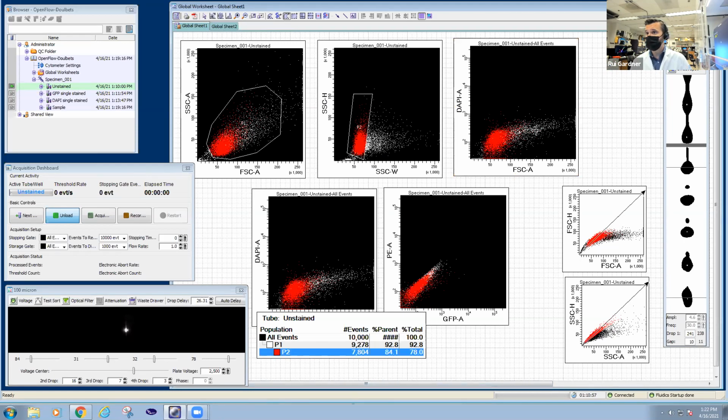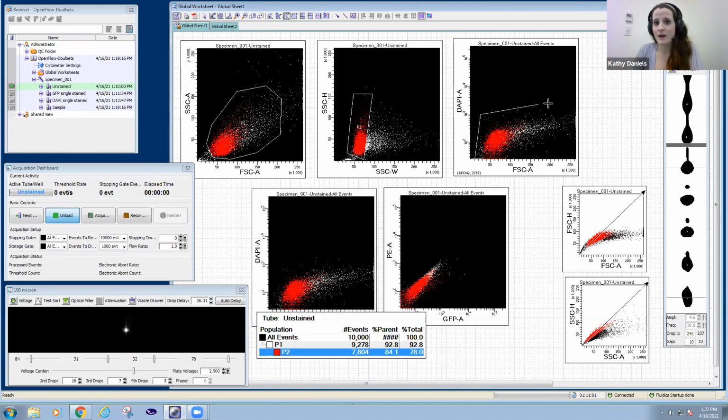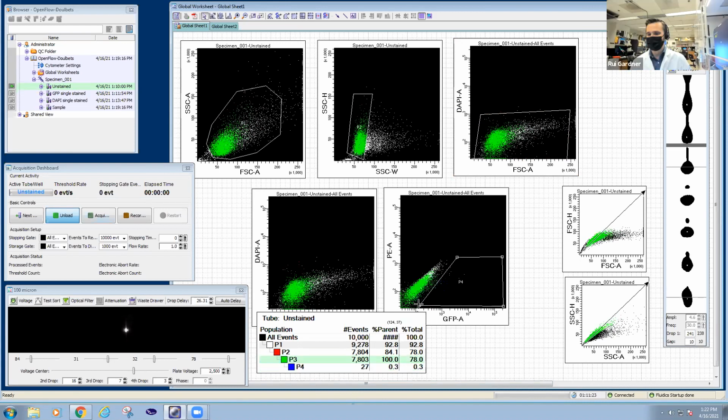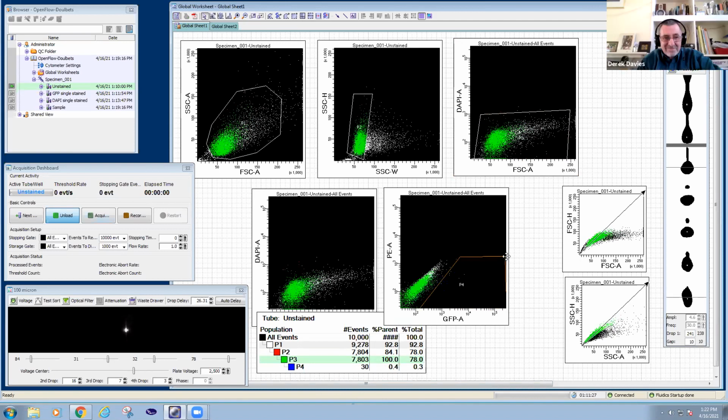Kathy, I don't know if you wanted to say something. Yeah, I just wanted to say I think it's a good thing for everyone to be aware of all the options as well, because it's a really good thing to explore based on your specific cells what has the best resolution. So sometimes you might have one set of cells, and it does not necessarily mean that that gating strategy is going to apply to all. Absolutely, you shouldn't always believe everything we say. You should explore your data. Exactly. Especially when it's me saying it.